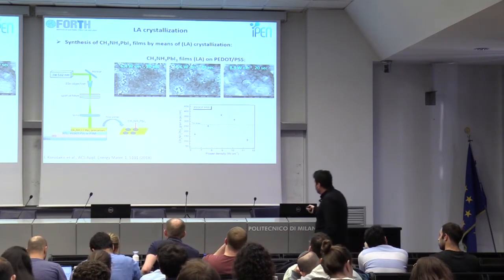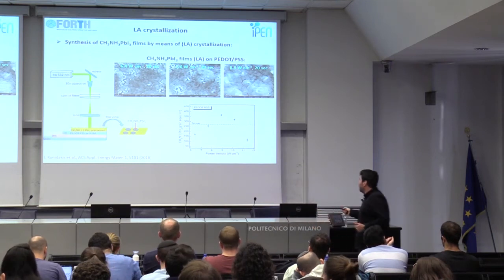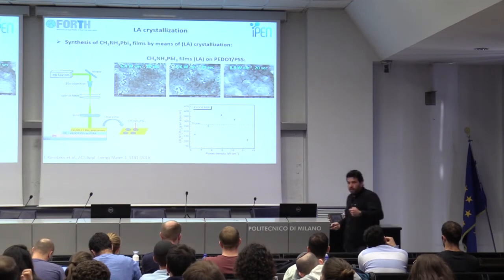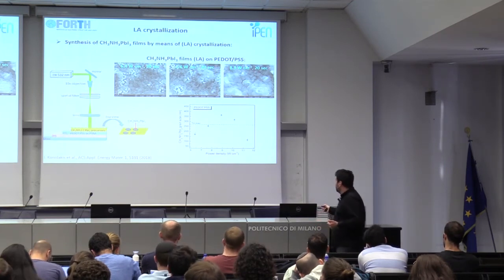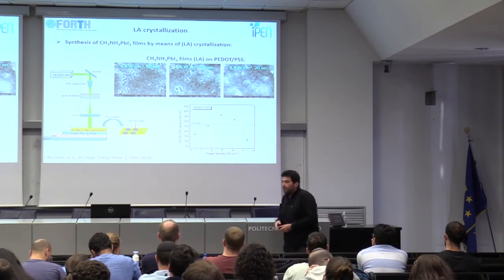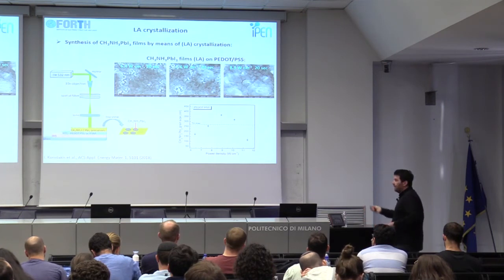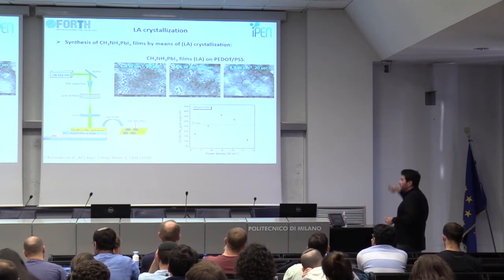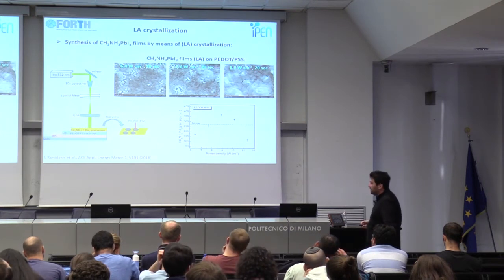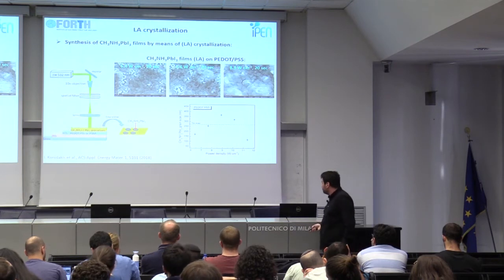And of course, here you need to be a little bit careful, because at the lower laser fluences, you don't achieve such good grains. When you reach a point where you have the optimum grain size formation, but then if you keep on irradiating the sample, you start ablating it, and then the grain size drops again. So this is, let's say, the best parameters to do so.